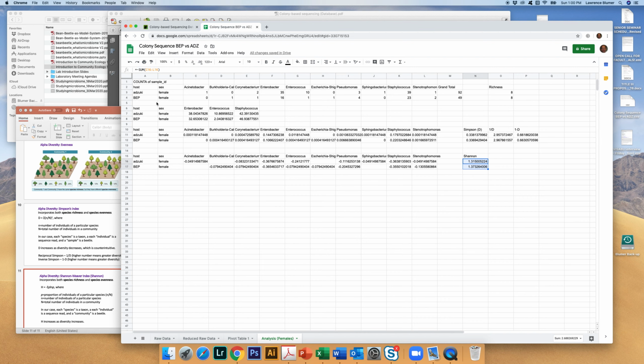This is going to end the recording I have on this analysis. It's worth doing this analysis and including it in your results, but there are other analyses, in particular the next-gen sequencing analyses, that you will want to do.